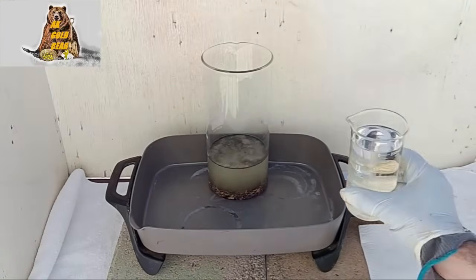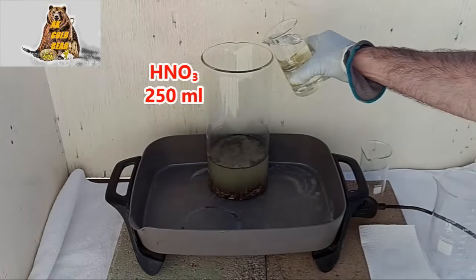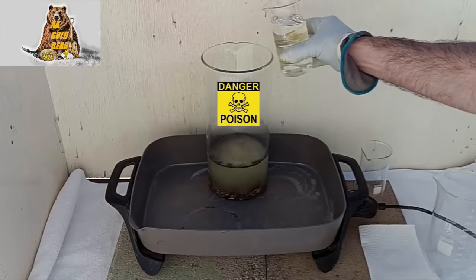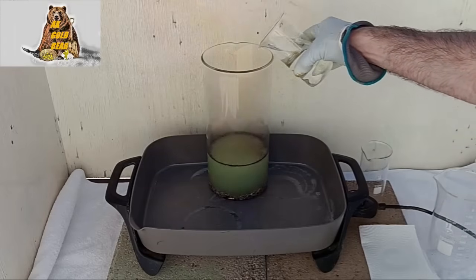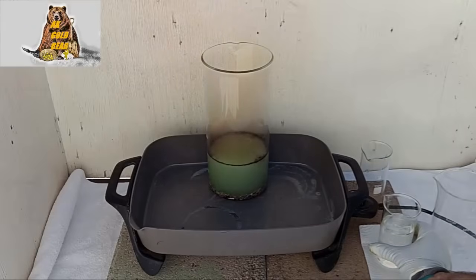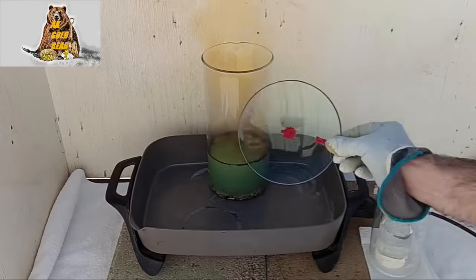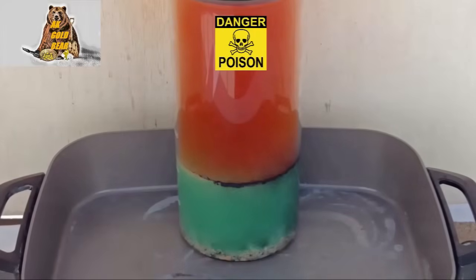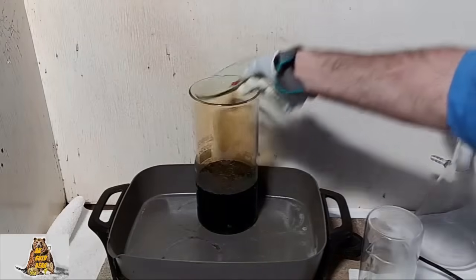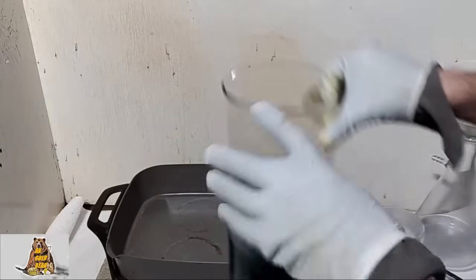Now 250 ml of nitric acid. I will add the nitric acid to the electrolyte 50 ml at a time — no need to rush. I think in two hours all the base metals will be dissolved. I hope. Everything dissolved quite quickly — it was a nice surprise. I think I dissolved everything in about one and a half hours.